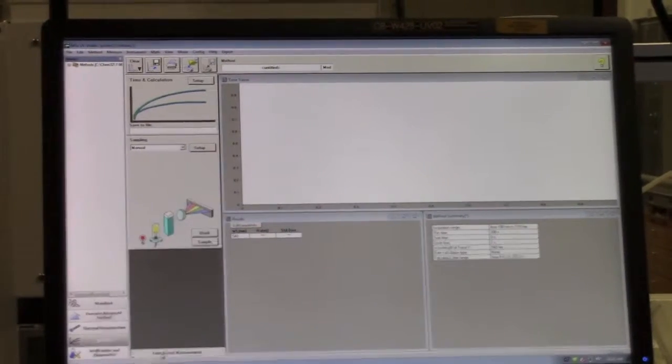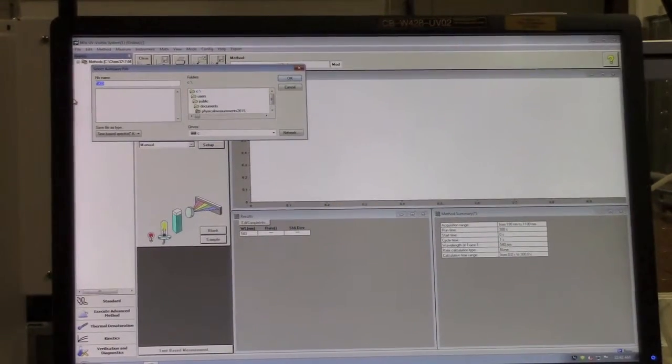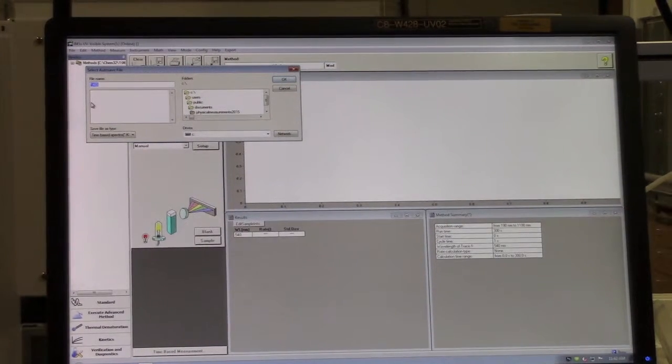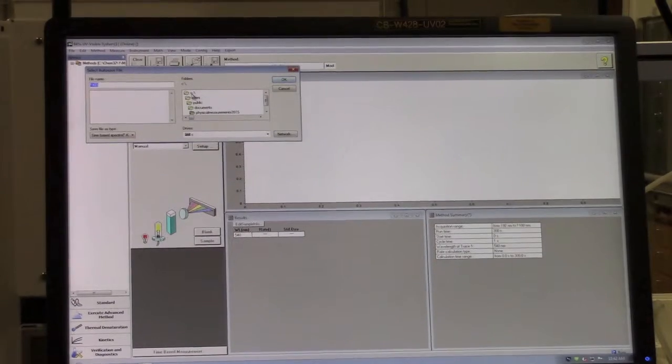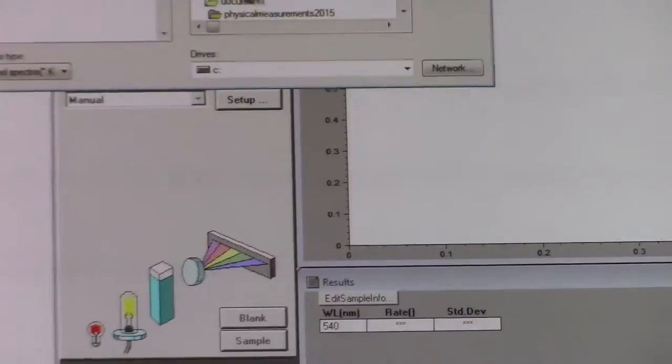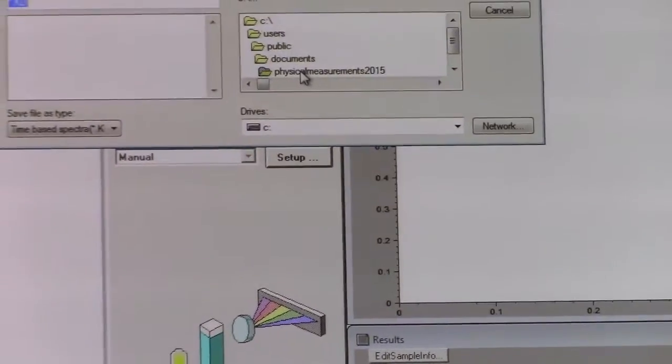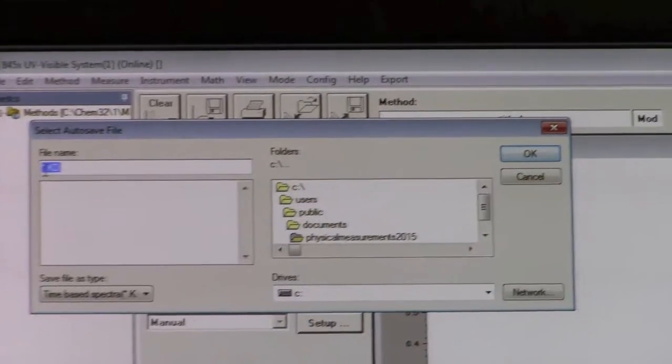Click on Time-Based Measurement and you'll be prompted to create an autosave file. Name this something appropriate to the experiment. Store it in C:\Users\Public\Documents, for example Physical Measurements 2015, and name it something appropriate.